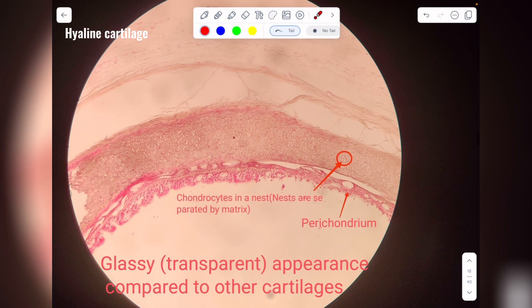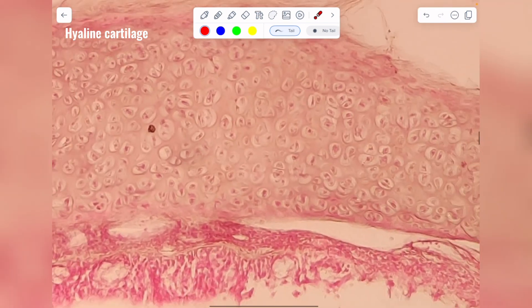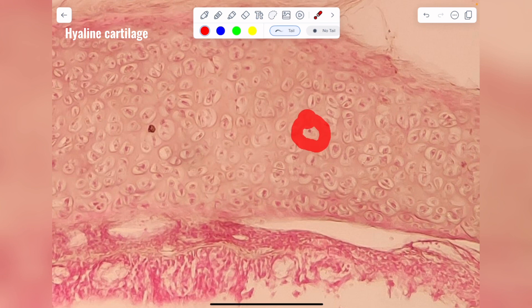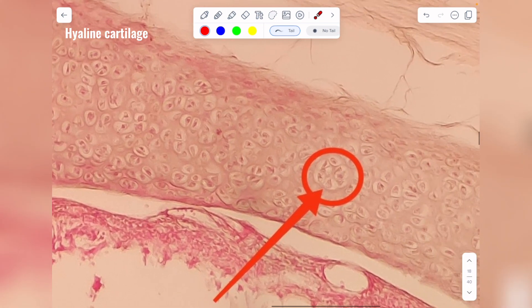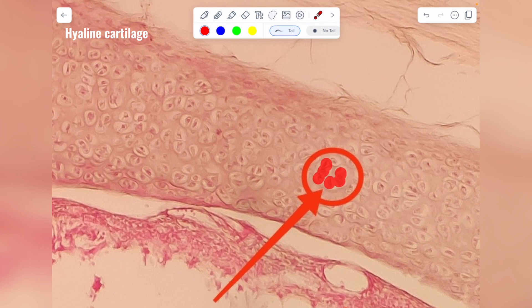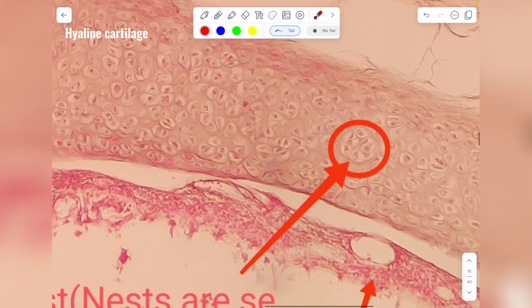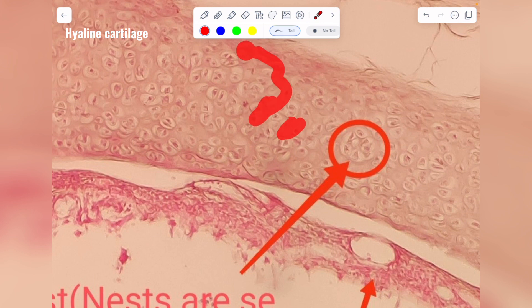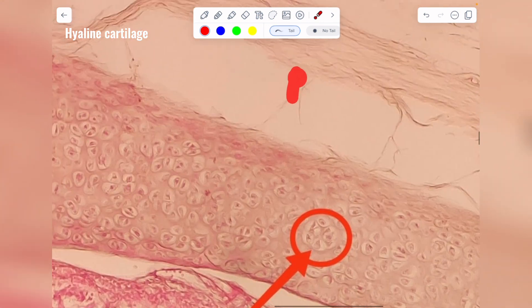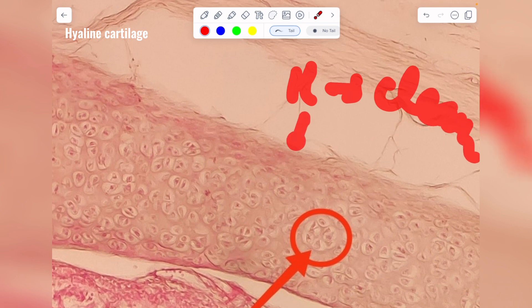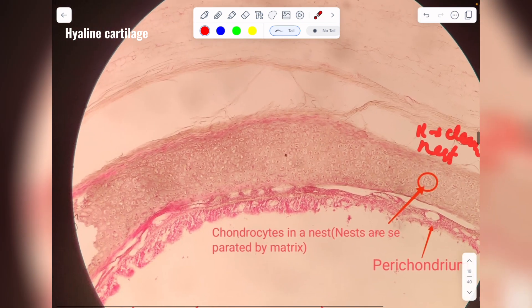Let's identify this cartilage slide. First, look at the chondrocytes — these are chondrocytes present inside fluid-filled spaces called lacunae. You can see that several lacunae contain multiple chondrocytes, forming what is called a nest. As mentioned earlier, if nests are present the matrix is clear, so this is hyaline cartilage.